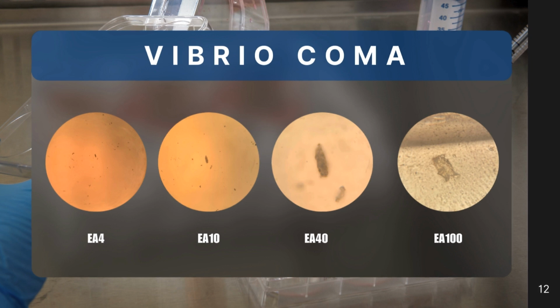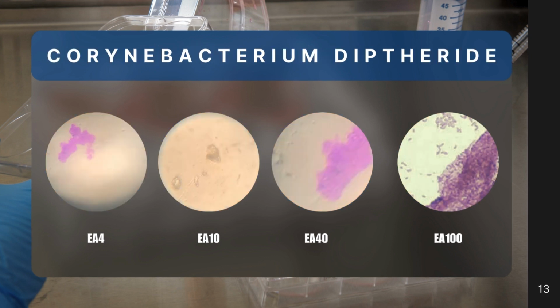The second slide is the Corynebacterium diphtheriae. Bacterium that can cause diphtheria, a serious respiratory illness.